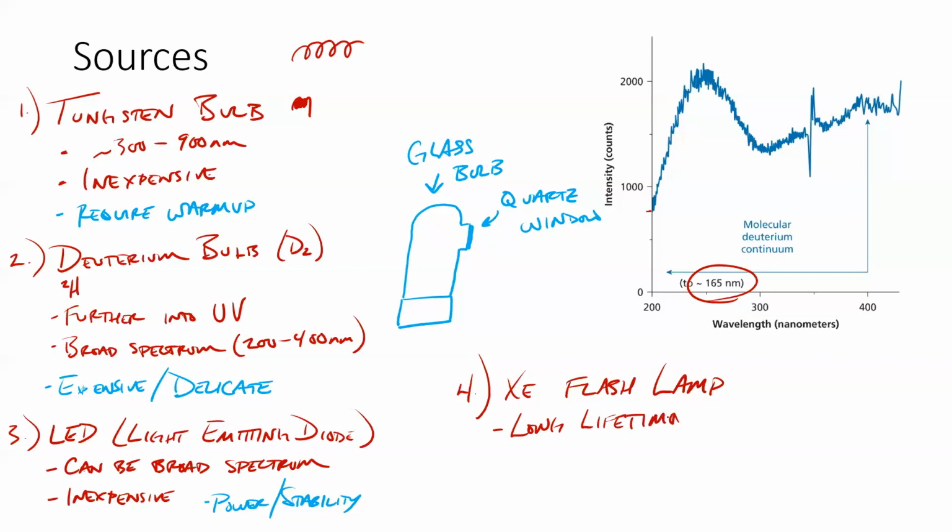The newer UV Vis instrument that we got in 2017, I think it was, has a xenon flash lamp in it, and it says it's good for something like 10 million flashes. And so, you know, even if it flashes 10 times a second, that's 1 million seconds of runtime, because it doesn't flash when it's not taking a spectrum. So there's a pretty long lifetime for the bulb.